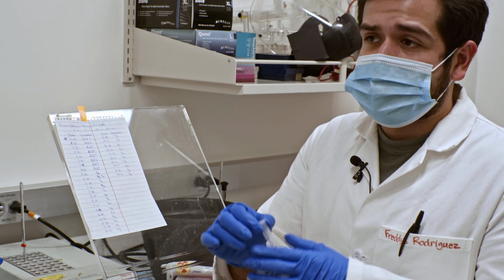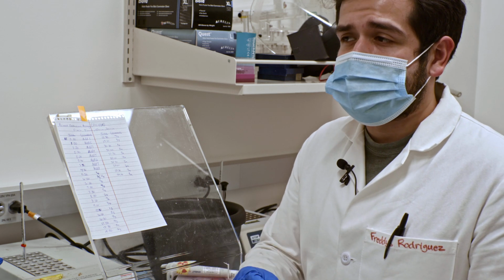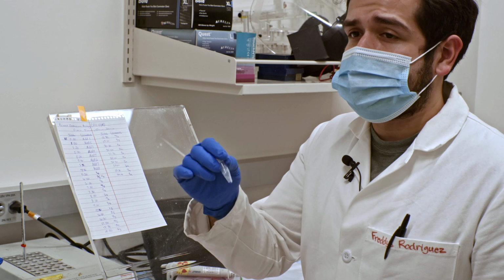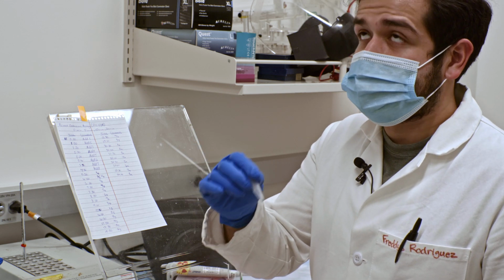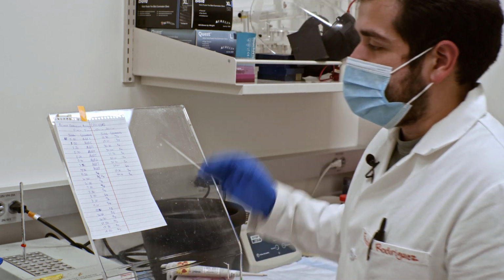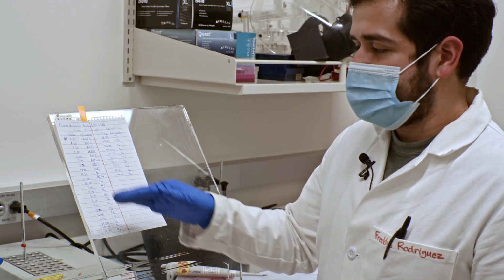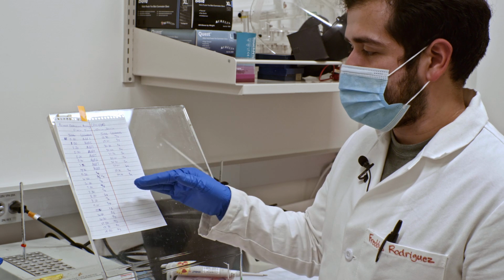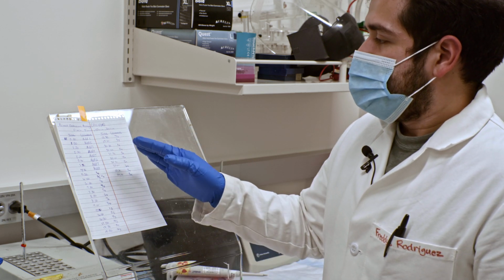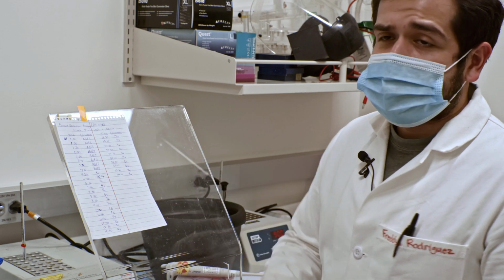Usually we get a 5 microliter sample from the reaction vessel and quench it with 4 microliters of a 95% formamide solution in order to effectively quench and collect that time point. And I will keep repeating the same idea of 30-second intervals between each sample take up until I'm done the experiment. So in other words, since I'm only taking 0, 5 minute, 15 minute, and 30 minute time points, I should be done by 34 minutes.